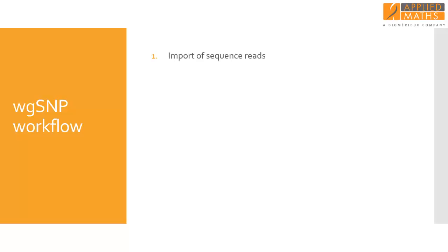First, you need to import your sequence reads in your database and store them in a sequence readset experiment. Sequence reads can be imported as data links in your BioNumerics database, resulting in a lightweight database. Sequence reads can also be stored inside the connected database, but this might fill up your database very quickly.